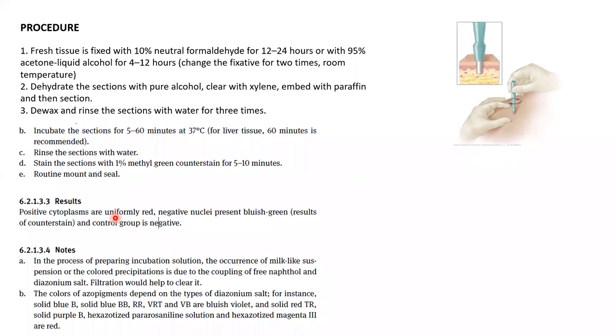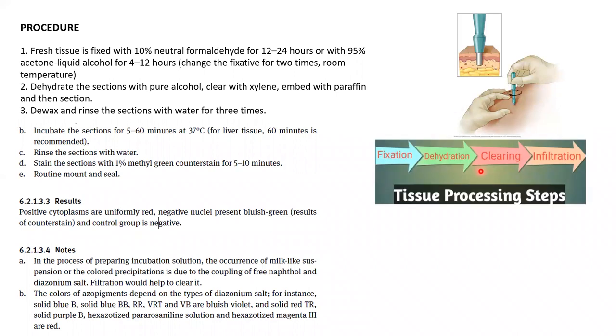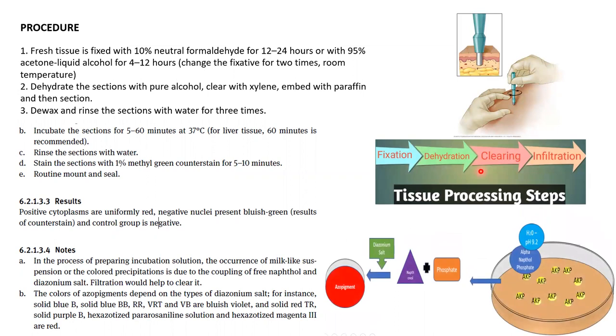Then we discussed the procedure. The procedure is very simple. We will take a biopsy material. It will be processed, tissue processed. Fixation, dehydration, clearing, infiltration. Then we will go for our principle.